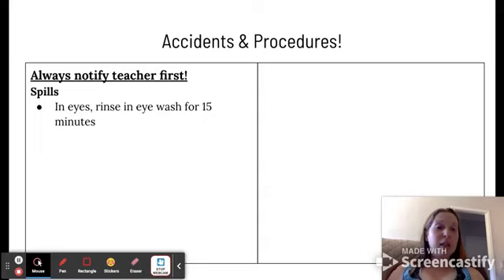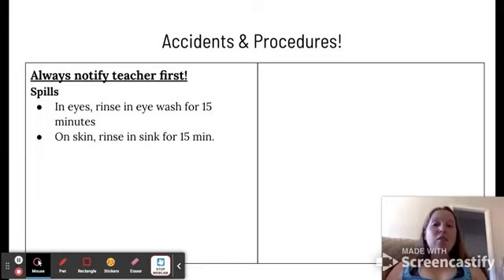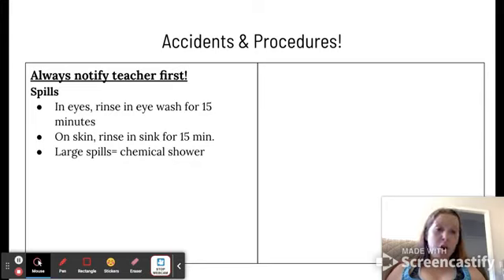With spills, if something gets in your eyes with or without safety goggles on, you have to rinse your eyes in the eyewash for 15 minutes and that water is ice cold. So please, please watch out from getting stuff in your eyes. If anything gets on your skin, you have to rinse it in the sink for 15 minutes. Again, with cold water. If it happens to be a large spill on you, like clothes and everything, you have to get in the chemical shower for 15 minutes.